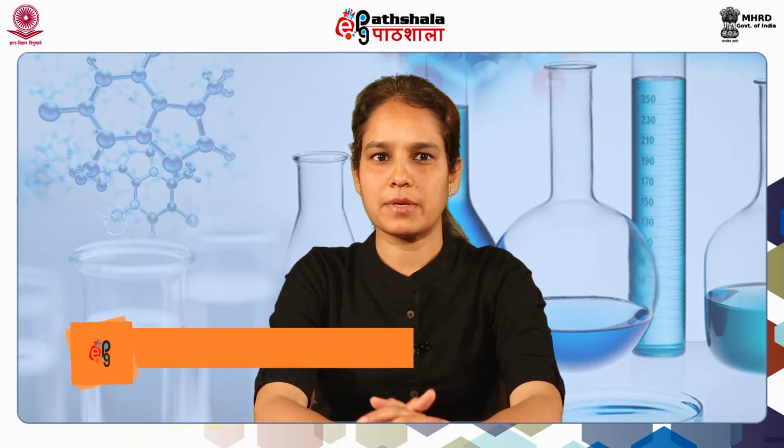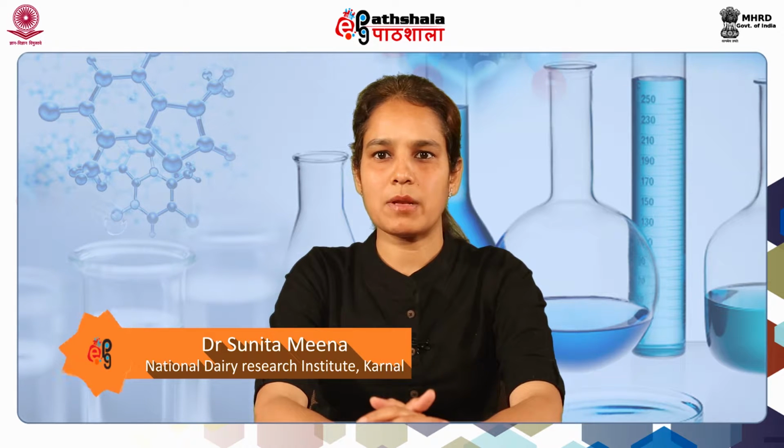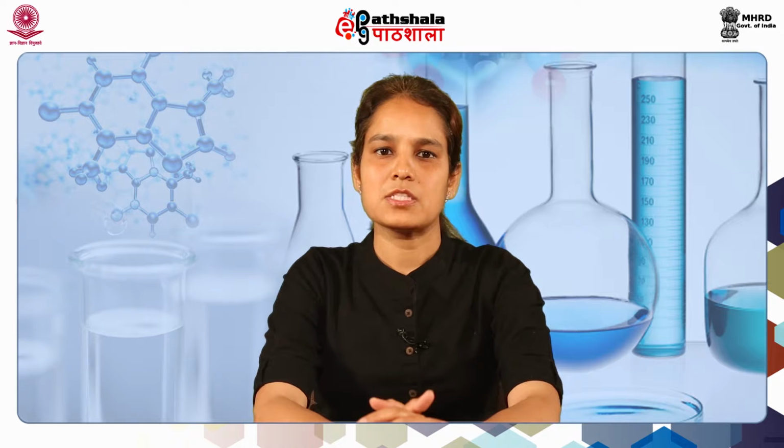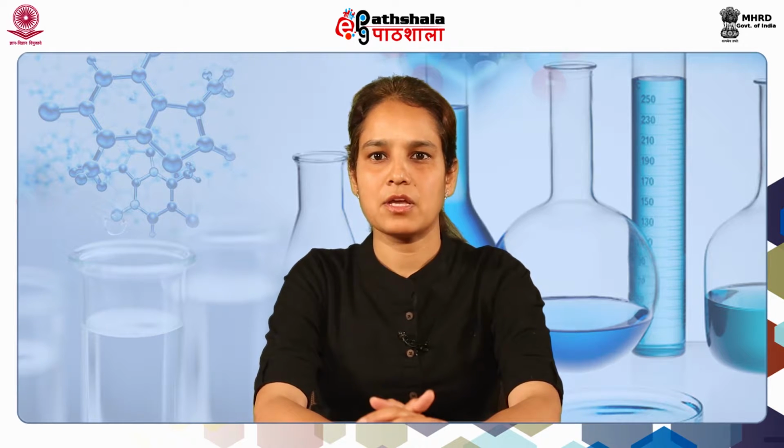I am Dr. Sunita Meena, scientist in Animal Biochemistry Division of National Dairy Research Institute, Karnal. Today, I am going to teach you the technique of UV visible spectroscopy under the paper Biochemical Techniques. Spectroscopy is the study of how light interacts with matter. We can use spectroscopy to determine the structure and functional groups in organic compounds. We will be learning about how to use UV visible spectroscopy.